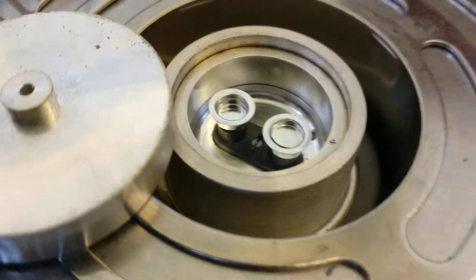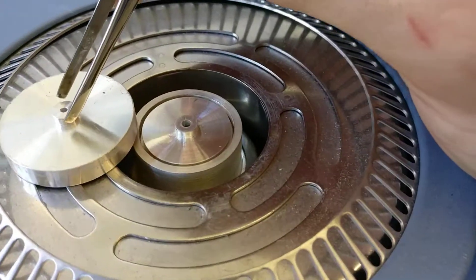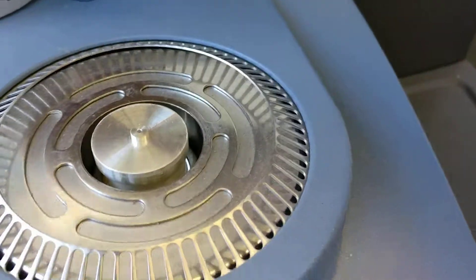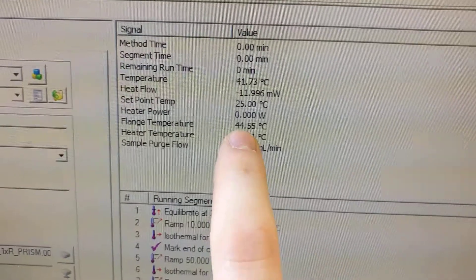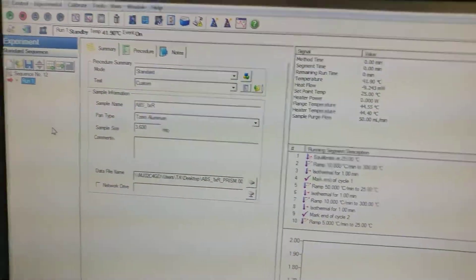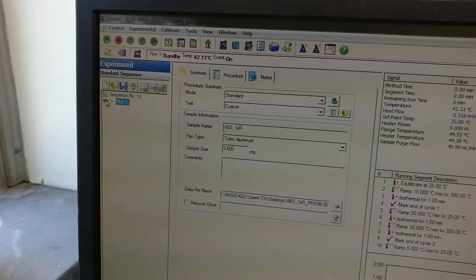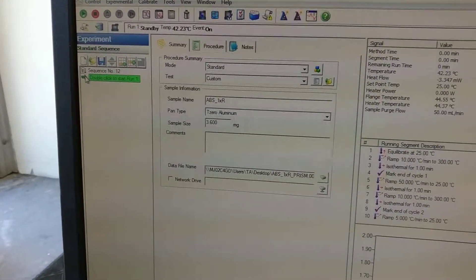That's pretty much it. Just pop the lids back on — the big cap last. As soon as you see the flange temperature get down to about minus 70 or 80, you can double-click the arrow icon and that will start the run.